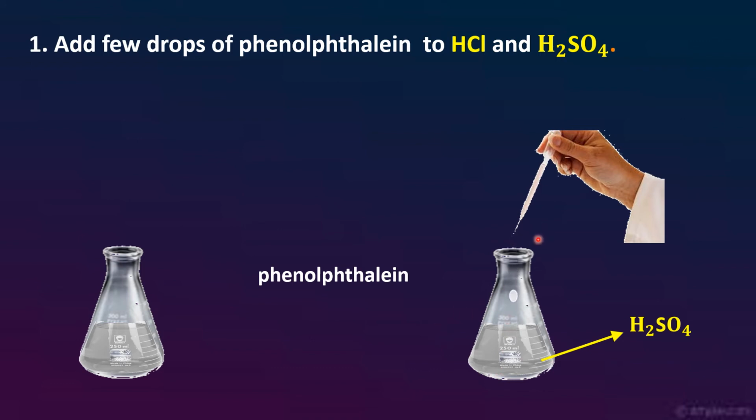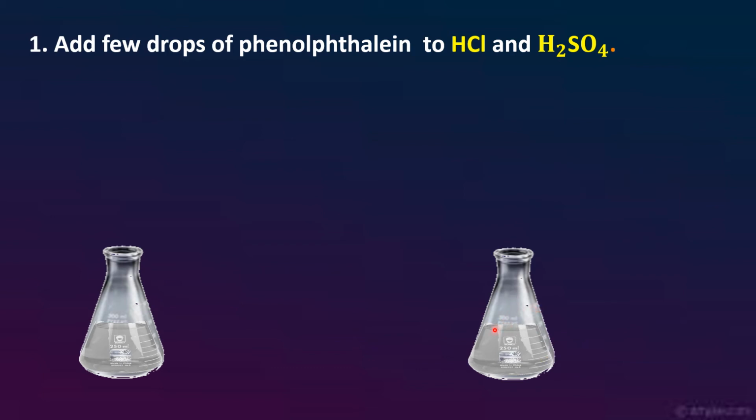This is also phenolphthalein indicator. So in both cases, we have added phenolphthalein indicator, but the solution remained as it is. We are not finding any change in the solution. So whenever phenolphthalein indicator is added to dilute HCl and H2SO4, we could not find any change in the solution.